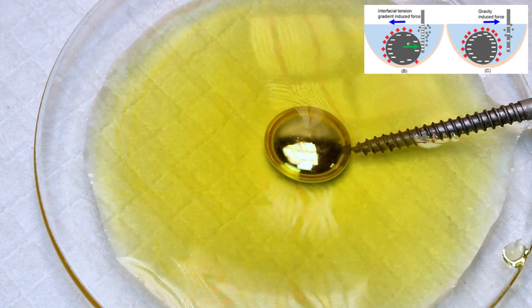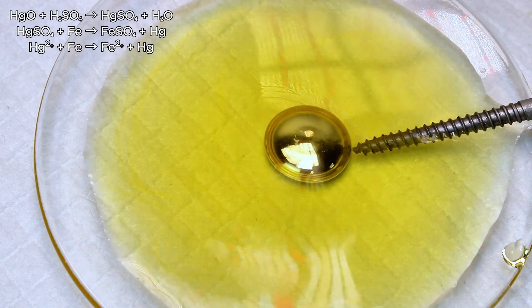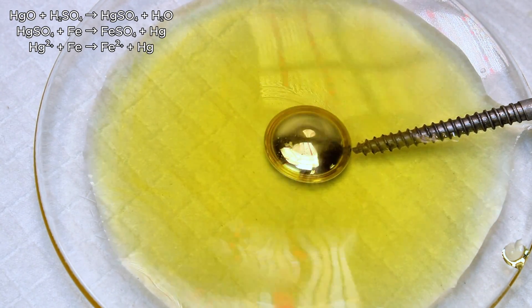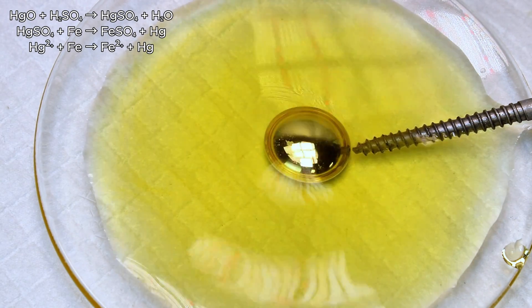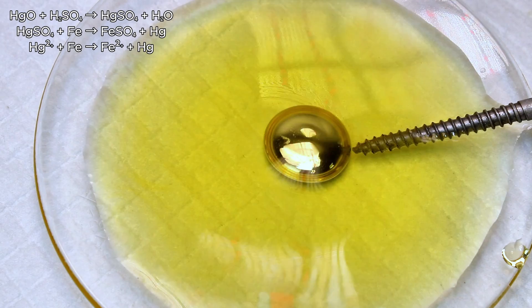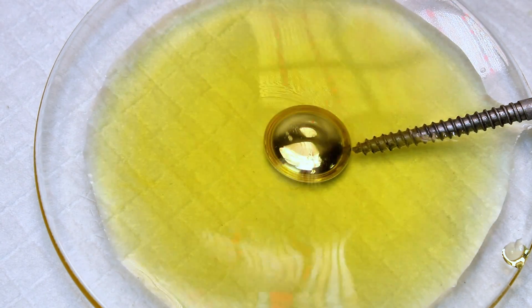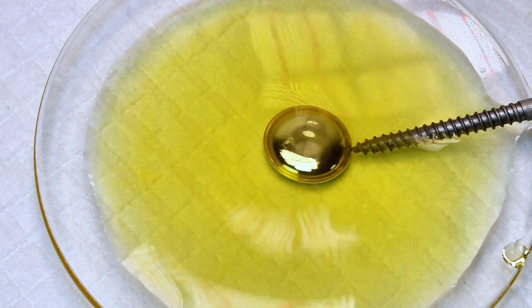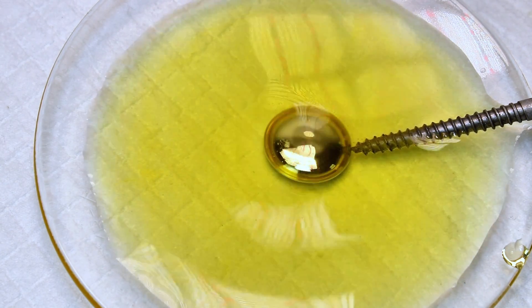The mercury oxide then reacts with sulfuric acid to form mercury sulfate, which is reduced back to metallic mercury when it comes in contact with the iron nail, with the iron itself being oxidized to iron sulfate. The reduction of mercury sulfate back to mercury instantly increases the surface tension and the blob rounds back out, only to immediately flatten once the new oxide layer forms.